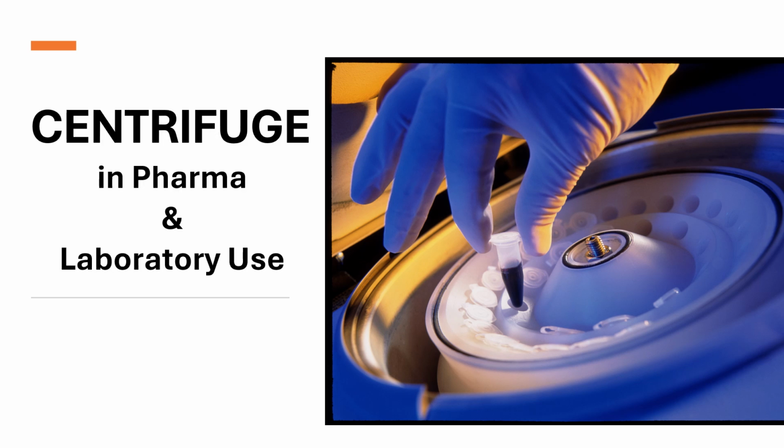So today in this video we will discuss centrifuge basics, and you can learn what a centrifuge is, its types, and how to operate it, along with other details, right?